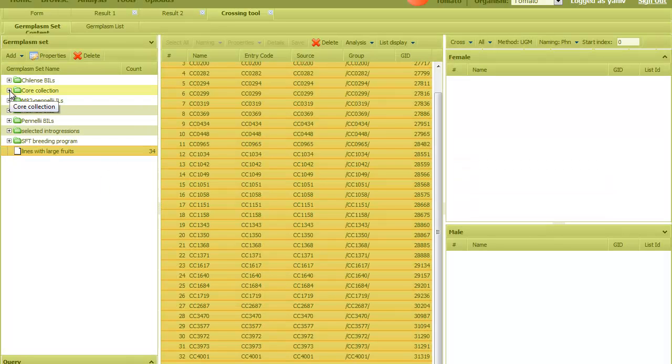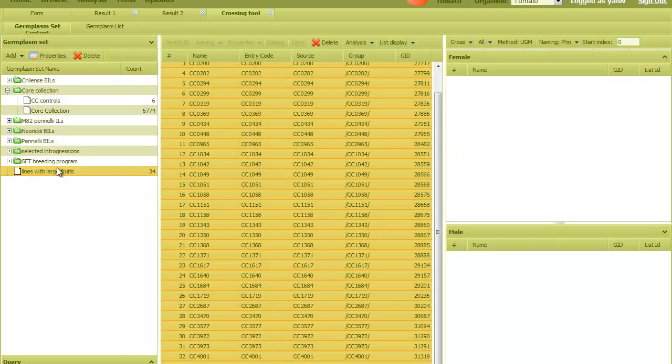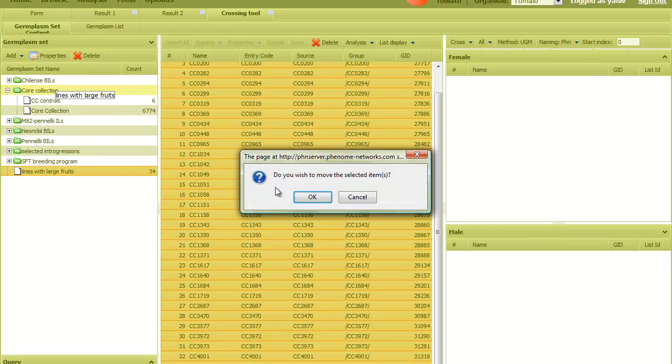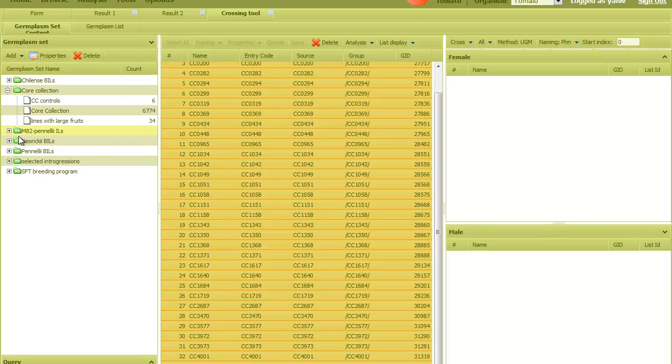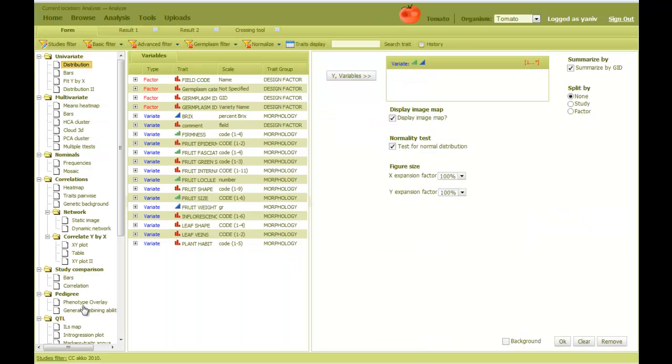And I can insert it into the appropriate folder. So I can access it and view it quickly.